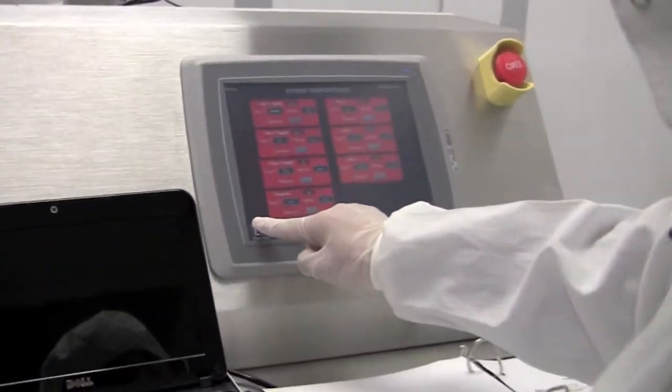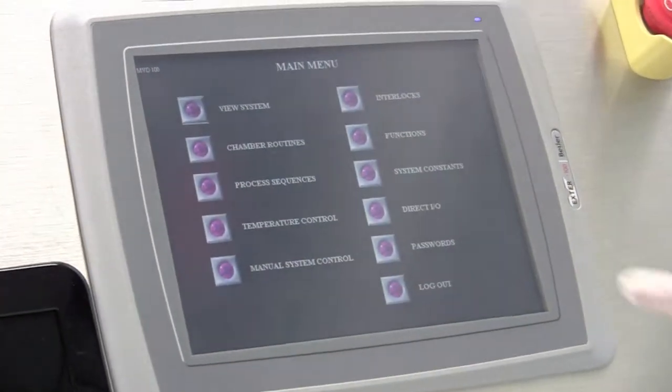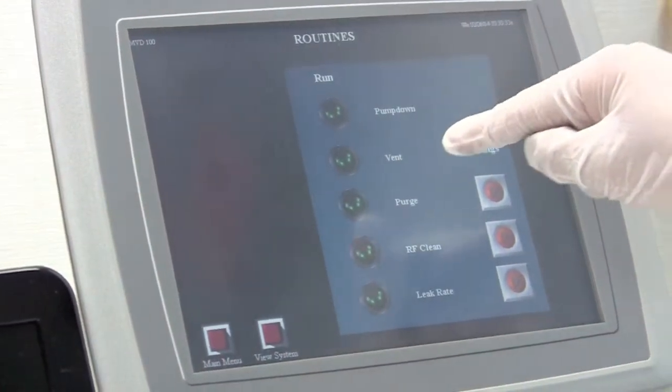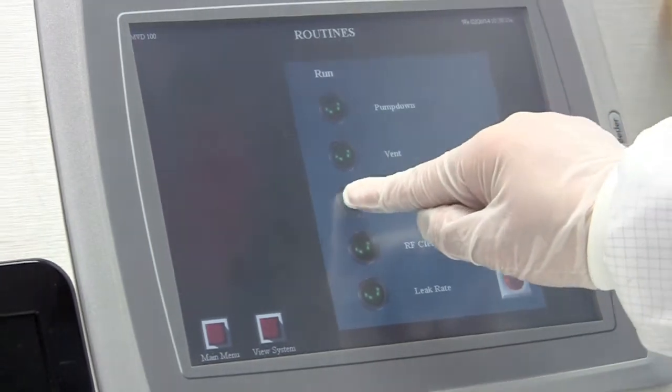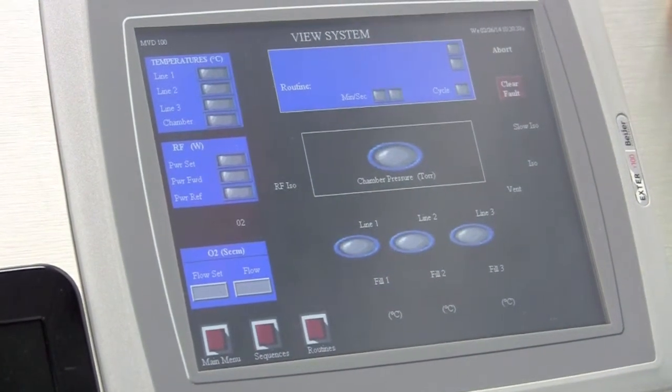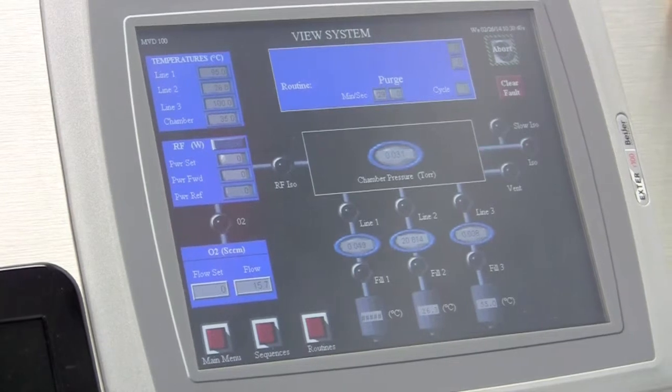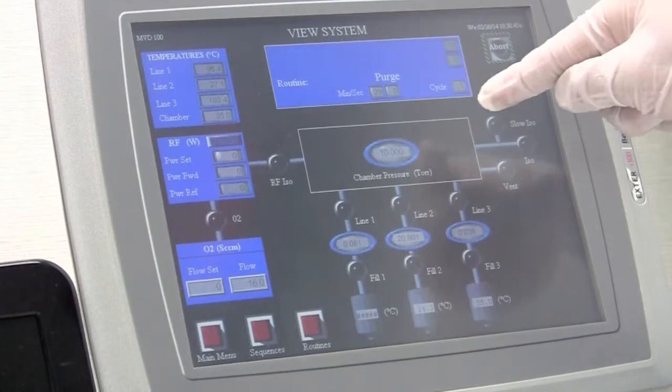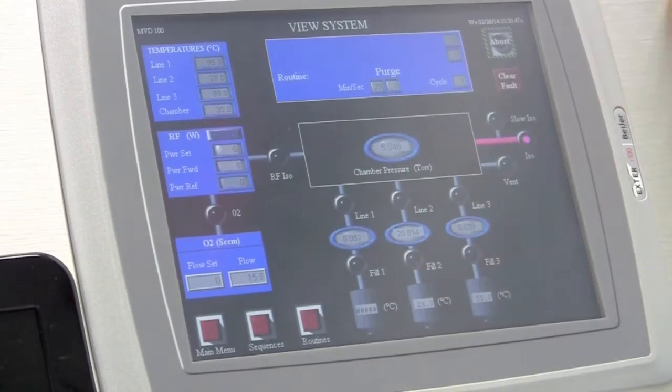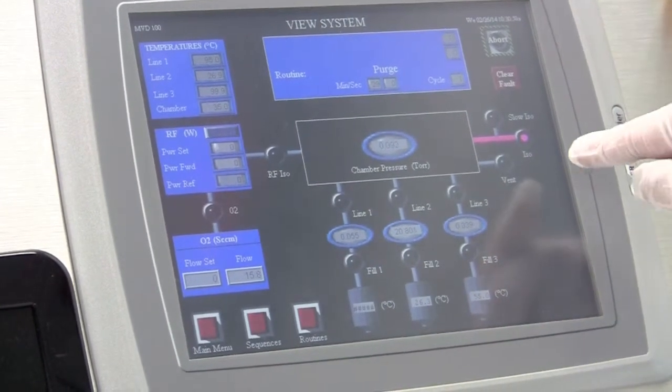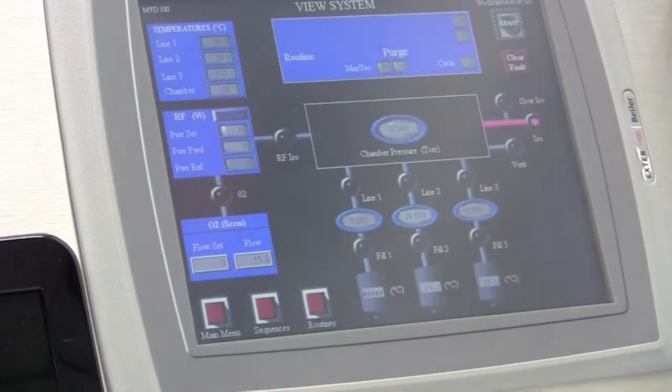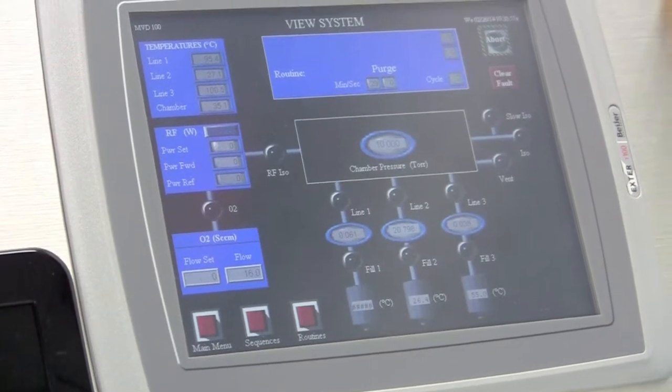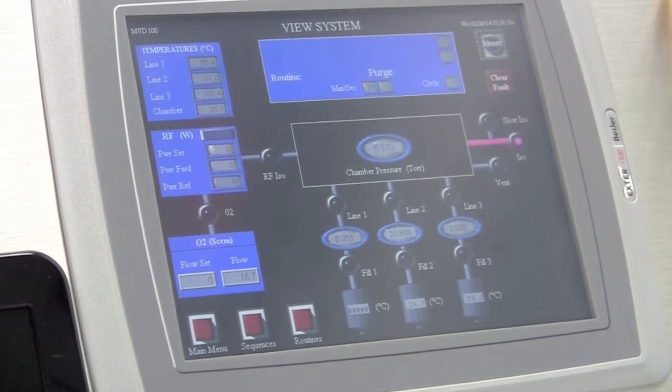So we touch main menu and touch chamber routines. Before we vent the chamber, we need to purge the chamber first. Now you see the nitrogen comes in and is pumped out. And it will come in again and pumped out again. By doing these 5 cycles, the purge process is completed.